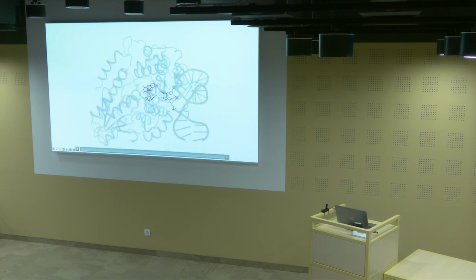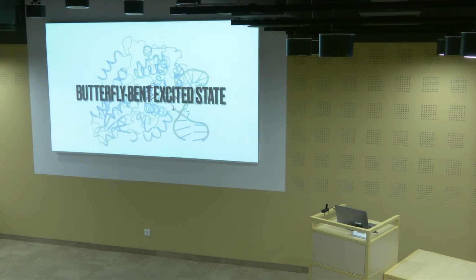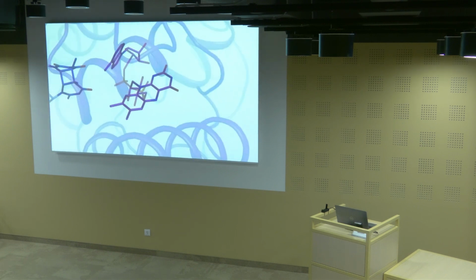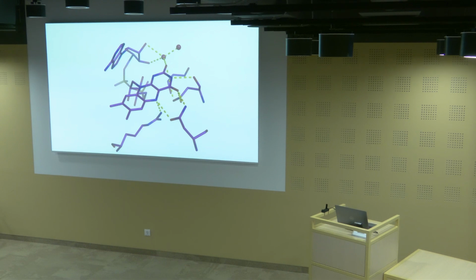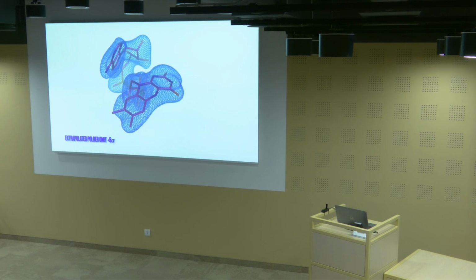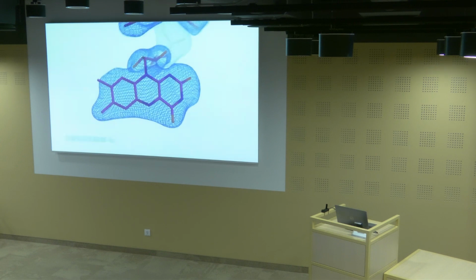And we'll start by looking at the fastest timescales and addressing what the geometry of the excited state looks like. And so here, we're zooming into the flavin, and you'll see a flash that represents the laser excitation. And for me, it's interesting to also watch how the residues around it basically move in order to accommodate the structural changes that are driven by this photon absorption.